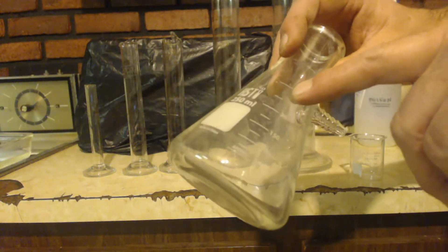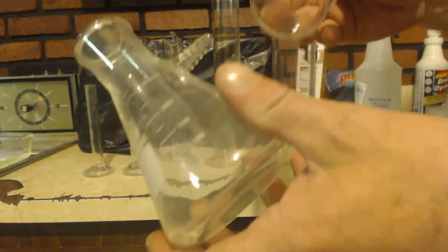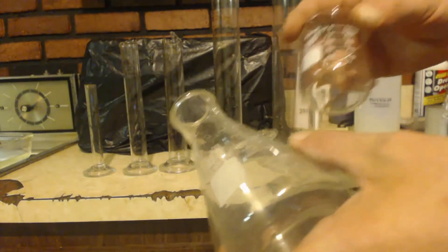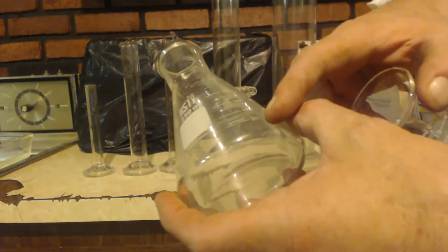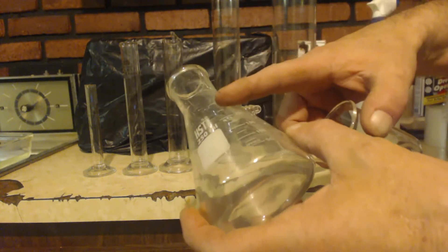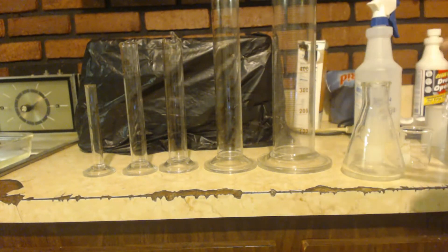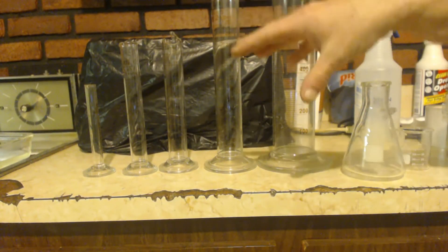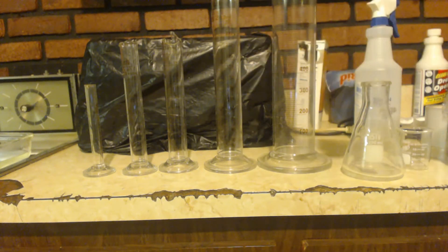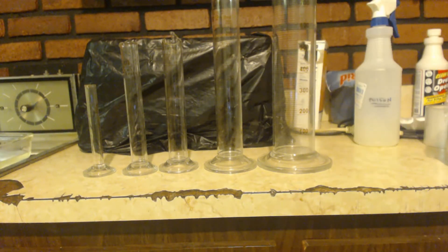If you're using beakers for a density test, you won't get an accurate result because those markings are not accurate. Both beakers and Erlenmeyer flasks are obviously for science and for measuring, so how much harder would it have been to make them exact? Once the machine is set, it's set — why wouldn't they set them to be exact? I don't know, but they're not. Graduated cylinders are exact, so use them. Anyways, I just wanted to show them off — enjoy your day!